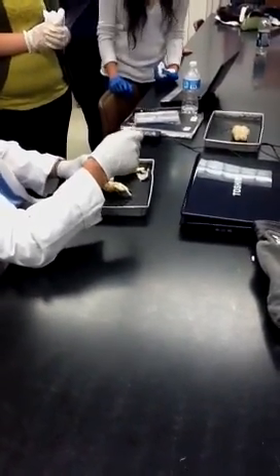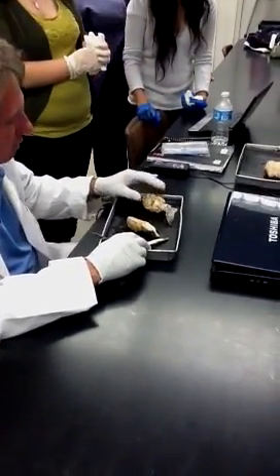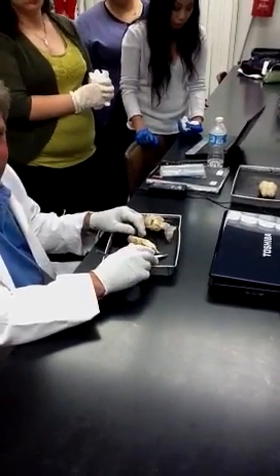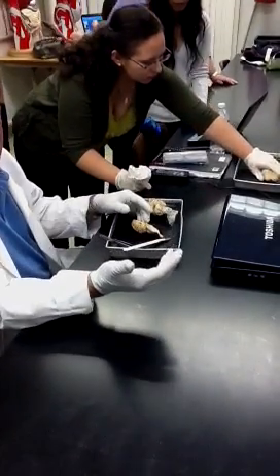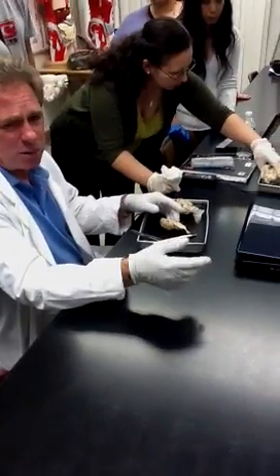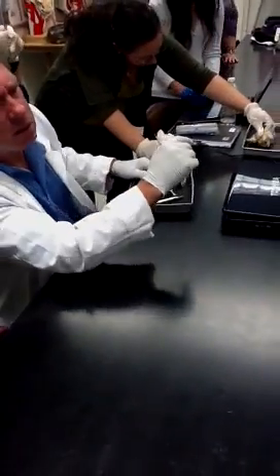I'm sure it's in. Professor Brady? Right here, it says number 14. What is that? Because you don't have it on the key. I don't have it on the key because on most of our sheep brains it's missing. It's the pituitary gland. We might have one or two in there that still have it. And when I get the demo brains out from Shannon next week, they still have pituitary glands on them. But when they harvest these brains, they just kind of pull them out. It's left behind.